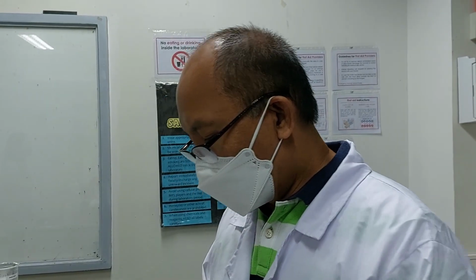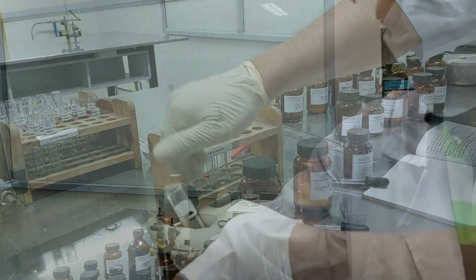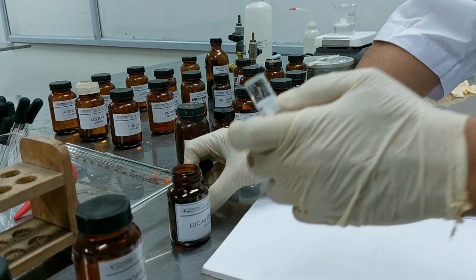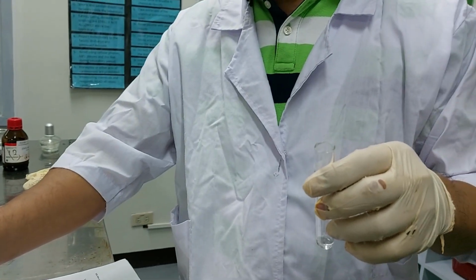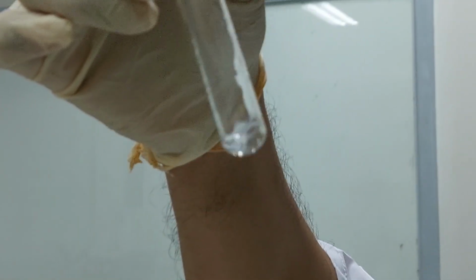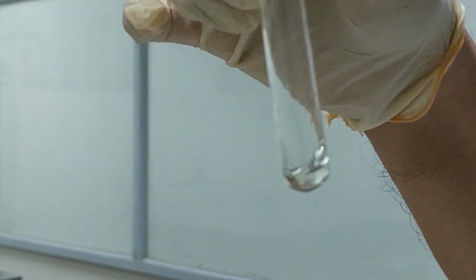So let's start with tertiary butyl alcohol. We're going to place just a few drops, 10 drops in this case, and then we're going to add Lucas reagent. The role of zinc chloride is that it serves as a catalyst, it will enhance the reaction. So we'll add also 10 drops of this one. Observe, I'm going to swirl, and there should be a layer, or if there is no layer, the solution turns cloudy.